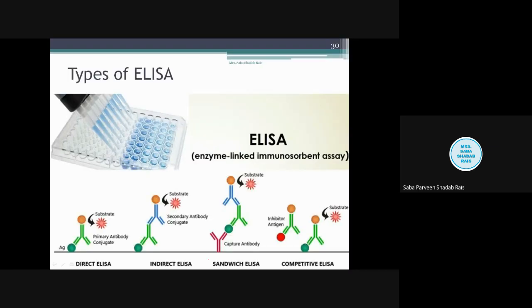So if the patient is having any other type of antigen, it will not bind, only and only X can bind over here. And after that the procedure will be the same, X will bind here, then after that we will do the washing. Then that antigen can be detected by either direct ELISA or indirect ELISA. In the case of direct ELISA, what we are going to do is add the anti-X antibody again. So here the antigen gets sandwiched between.